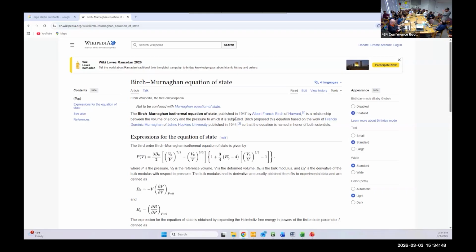You're measuring the volume, you're measuring the D spacing, and you're saying what pressure this D spacing would correspond to. You'll come out here at room temperature, but then you're adding a component of pressure at room temperature, and then adding a component of temperature at ambient pressure. I think I did a pretty bad job of explaining that.